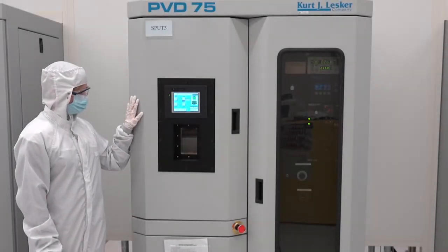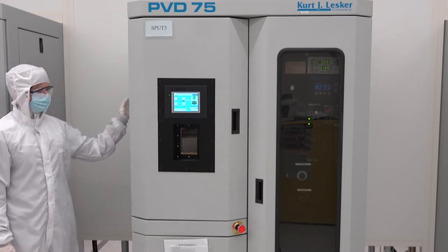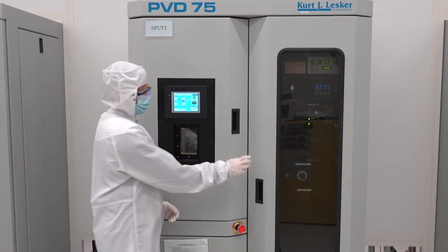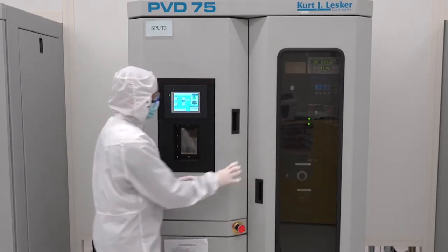This is the sputtering system. This is the vacuum chamber, and positioned behind it, out of sight, are the mechanical vacuum pump and the high vacuum turbo pump. To the right of the vacuum chamber are the electronics, which I will discuss in a minute. When not in use, the vacuum chamber is kept under vacuum at low pressure to keep the inside of the vacuum chamber as clean as possible.